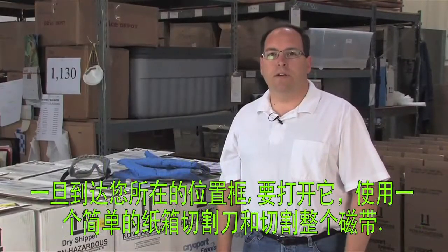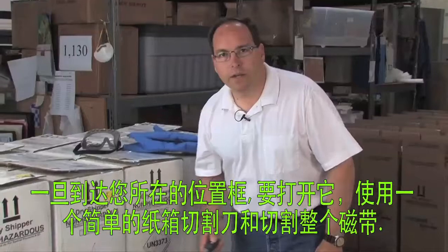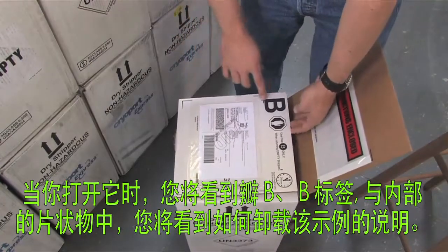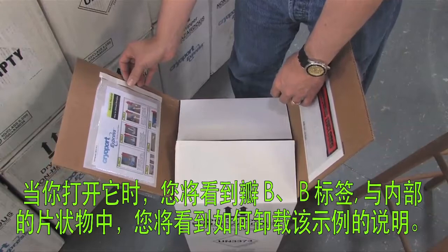Once the box arrives at your location, you'll want to open it by using a simple box cutter and cutting across the tape. When you open it, you'll see flap B, labeled B, and on the inside of that flap will be the instructions on how to unload the sample.